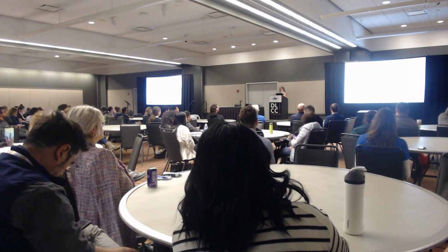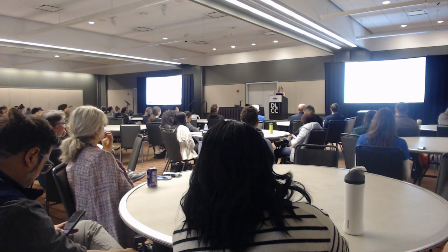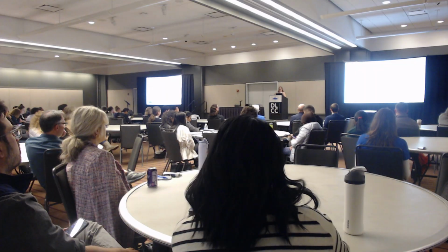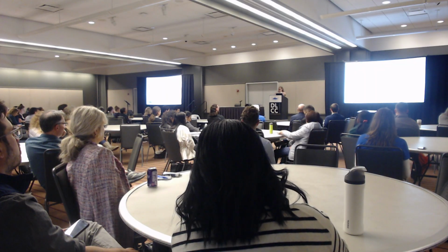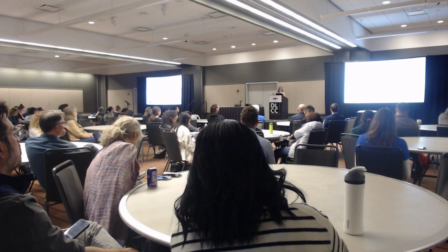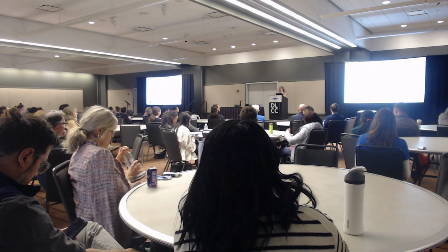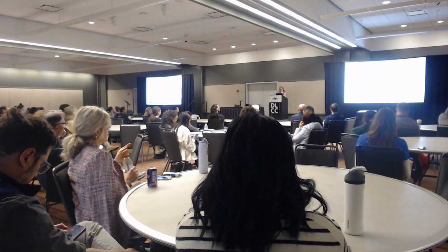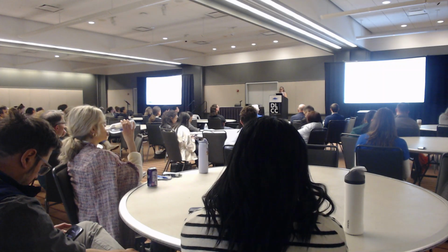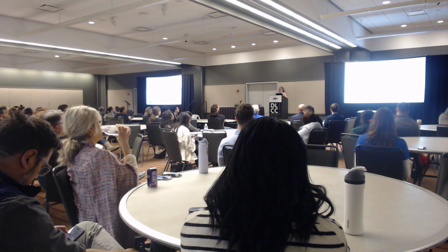We said, well, okay, that's if we're only looking at regions from differential methylation or hydroxymethylation, so those are where the significance is. But there are regions that we're not picking up where there is some sort of shift or switch between the two conditions. There had actually been a paper that came out doing that type of analysis using the Illumina methylation arrays. So I gave that to Raymond, and Raymond just implemented that in our pipeline. It wasn't easy, but he got it done.